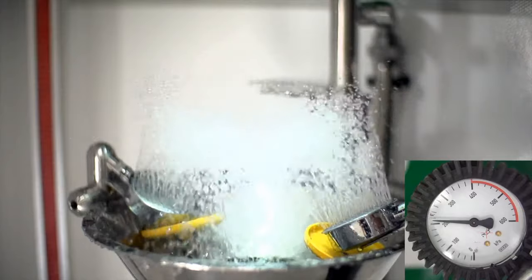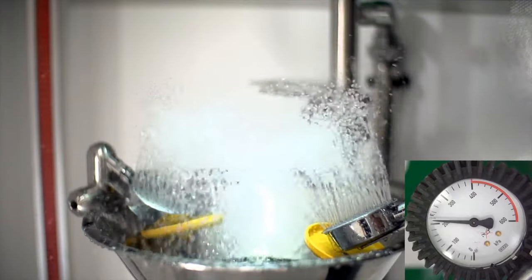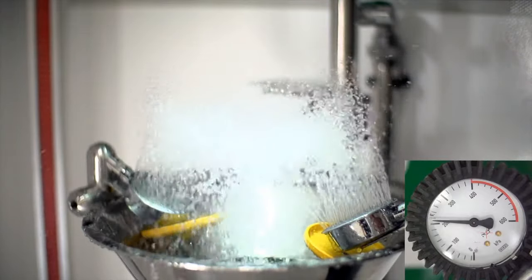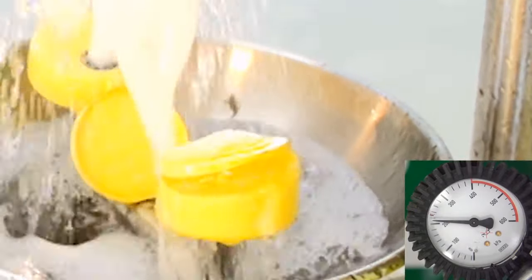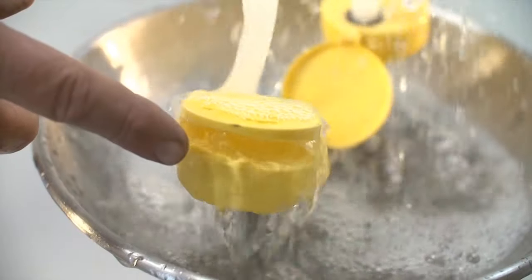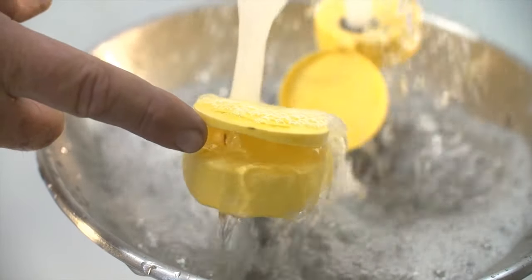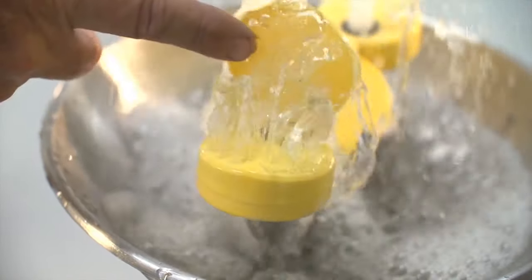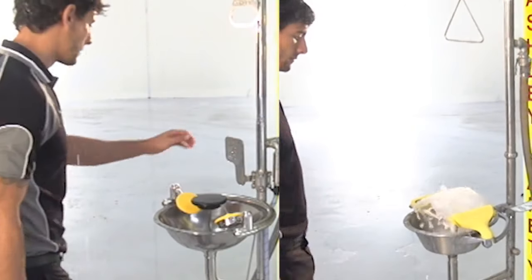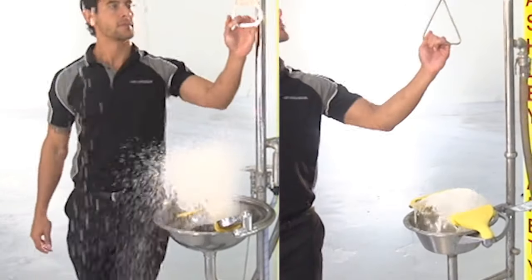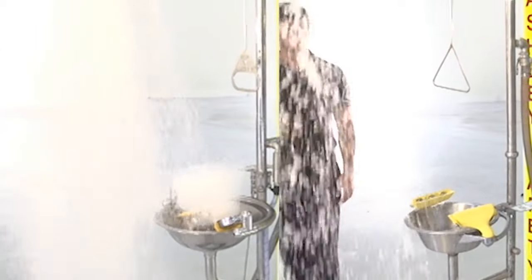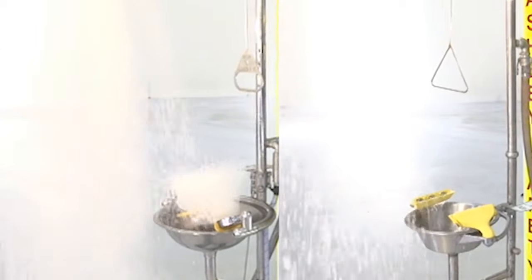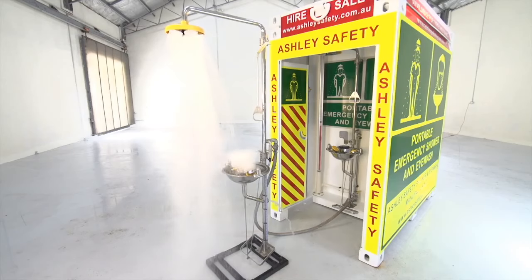Water flow: The water flow is one of the most crucial aspects of the safety eyewash. While others are unable to maintain flow at 210 kilopascals or even push off their own dust covers, Ashley's shower functions perfectly. Many eyewashes struggle to maintain pressure when the overhead shower is activated. Ashley's flow is regulated, ensuring the same consistent pressure at all times with the eyewash and shower operating simultaneously.